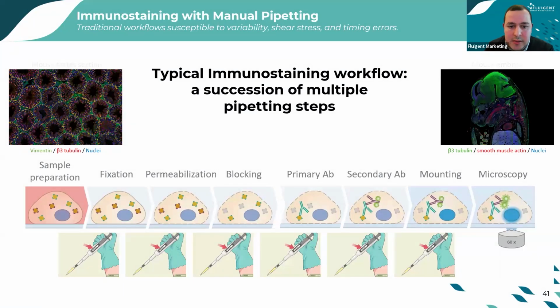While it is functional, this approach introduces significant variability, such as uneven reagent coverage, which can lead to inconsistent staining.